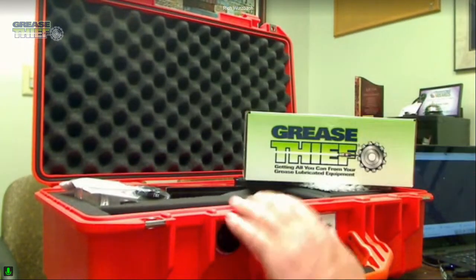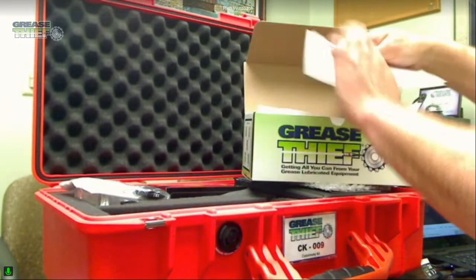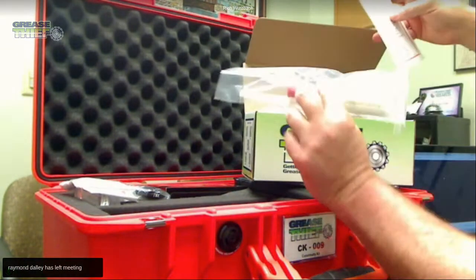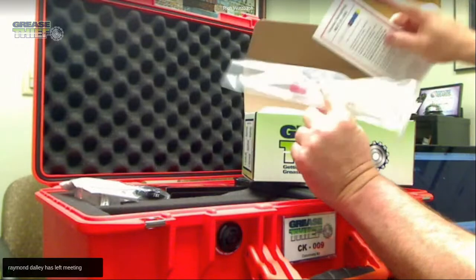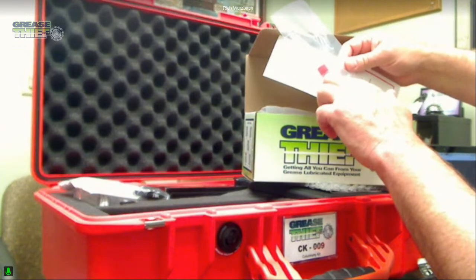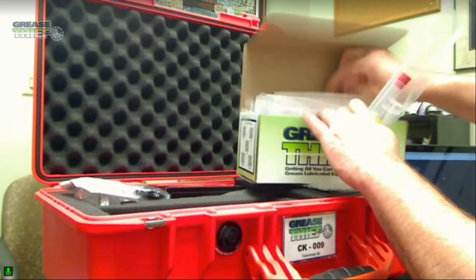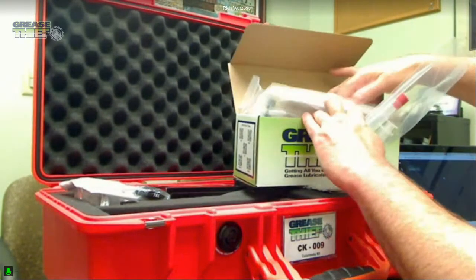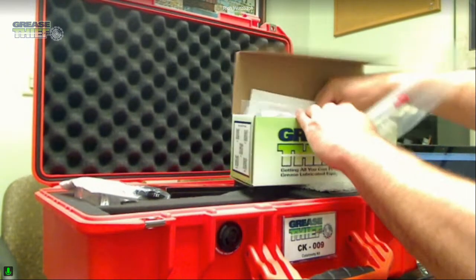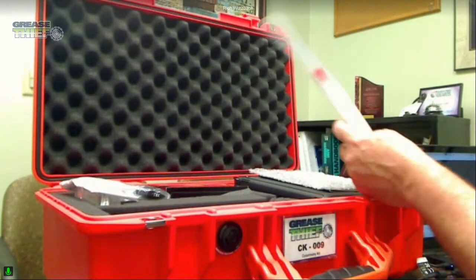Well, we've got a Grease Thief sampling kit, that has in here your sampling instructions to tell you how to use it. It's going to have these 8 sleeves that I talked about inside. You're going to have different tools. You've got a Grease Thief. You might have a label, a little container to ship it back to the laboratory if you need that. Even a return envelope is here to be able to send that back to the laboratory if you're going to need that further analysis. But we're going to focus on it today as if we're just going to take a sample and do that right on site.